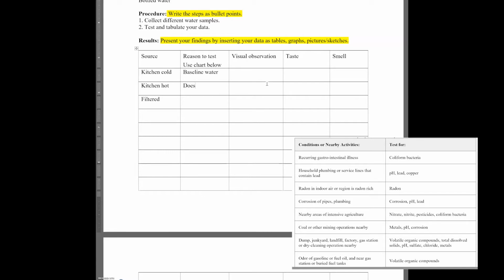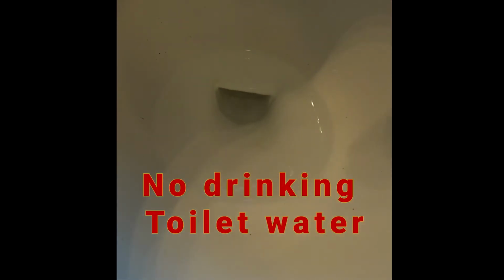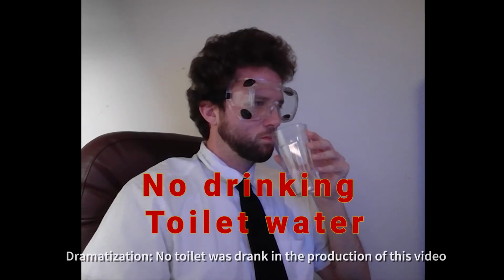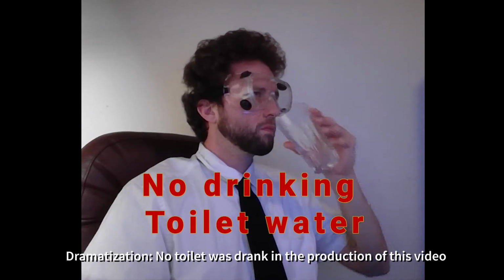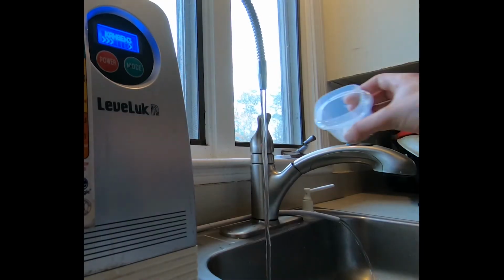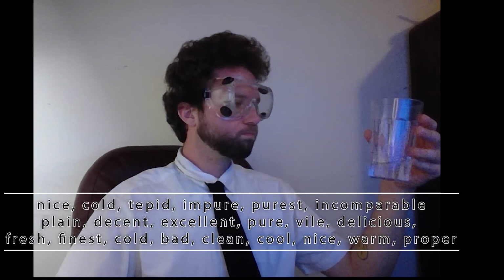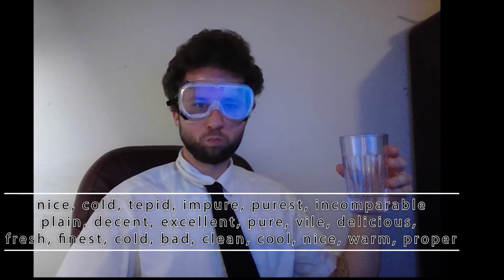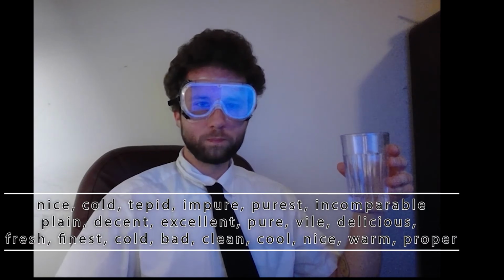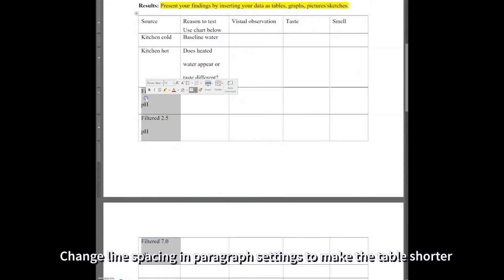Back at the lab manual, let's fill out the reasons to test. We can use the chart below, but remember that we do not drink any unsafe water, especially from the toilet. If you have access to a water filter, you can obtain a sample from that. Taste every water sample and try to think of an adjective to describe the taste of the water. Moldy or musty, bleach, bitter or medicinal, metallic, rotten eggs, sulfur, salty, sweet.